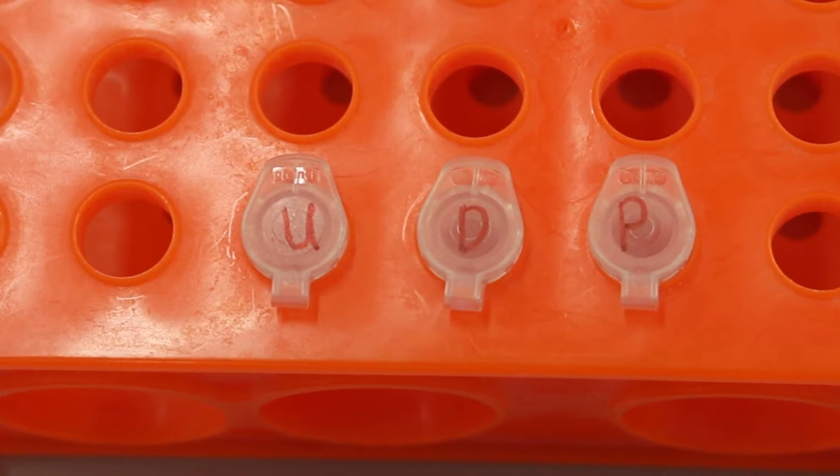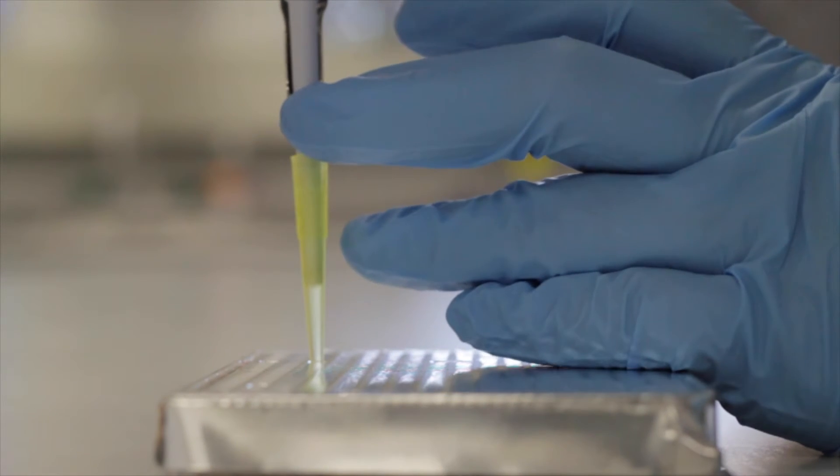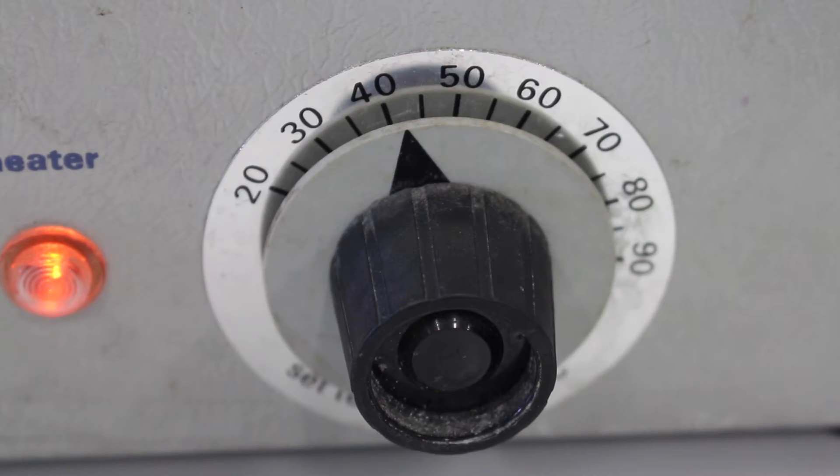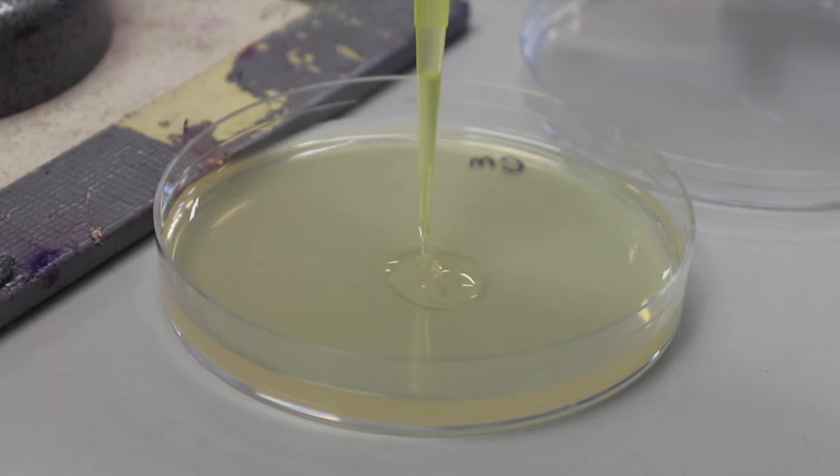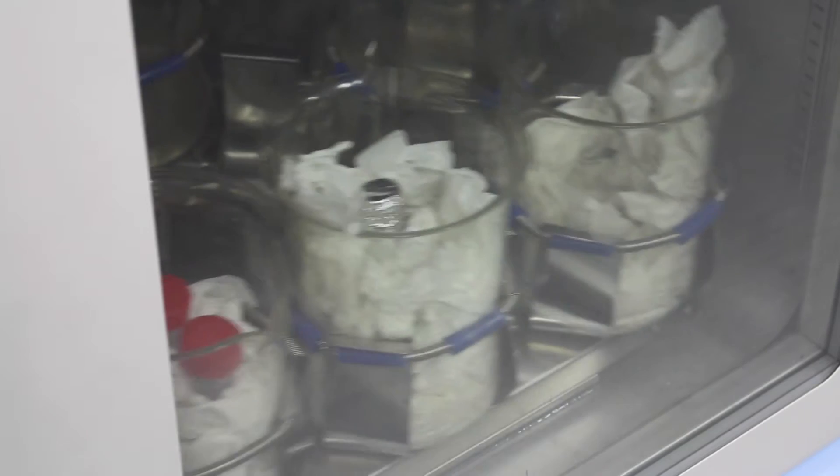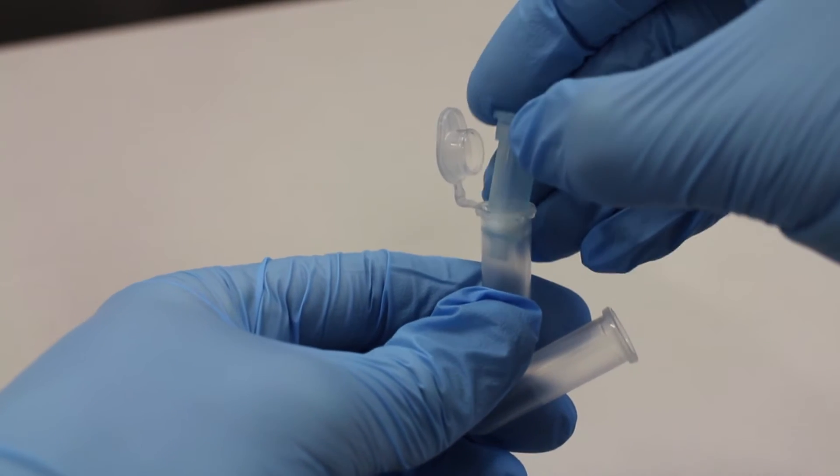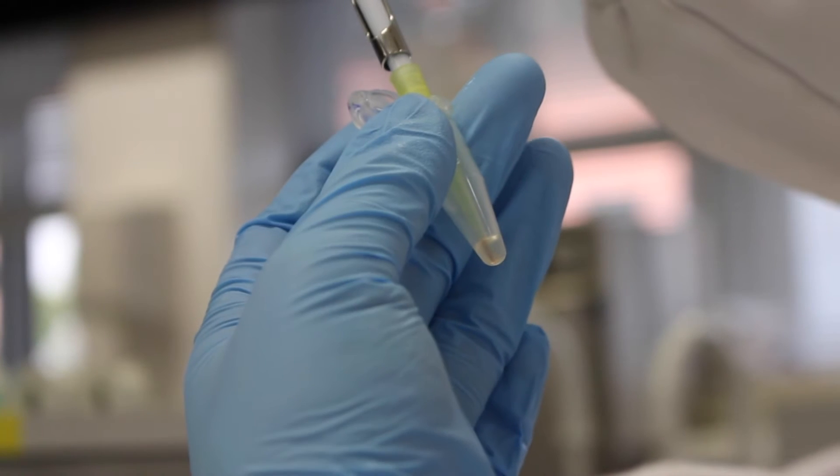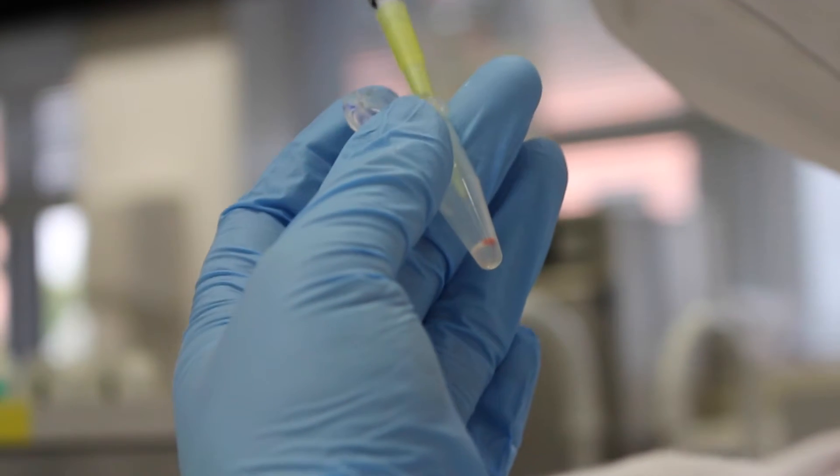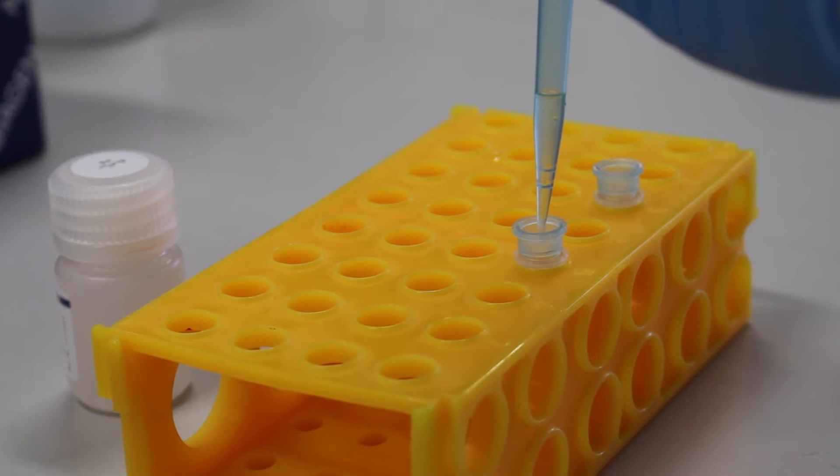To do BioBrick 3A assembly, you first need to transform E. coli cells with the plasmid DNA from the distribution kit. Set up an overnight culture of the transformed cells, then do a mini prep to produce purified plasmid DNA. Click on the links provided to learn how to carry out a transformation, prepare an overnight culture, and carry out a mini prep.